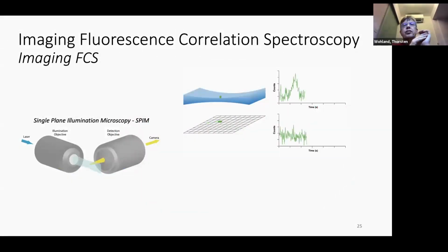How many lipids does Wnt3 actually have? For that, we used, again, imaging fluorescence correlation spectroscopy. We use an array detector camera, but in this case, we use a light sheet. So we use one objective to create a light sheet, with which we can eliminate any kind of cross-section in the sample. And under 90 degrees, we collect the data and put this on the camera. So we get at every single pixel, again, a correlation function of whatever we illuminate in our fish.